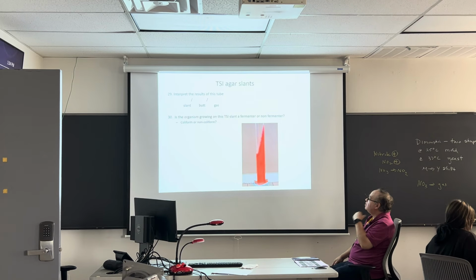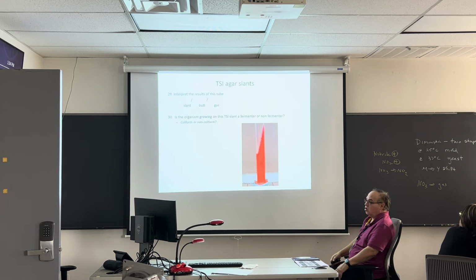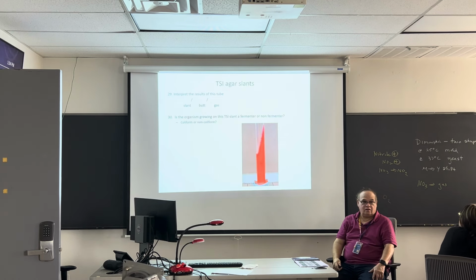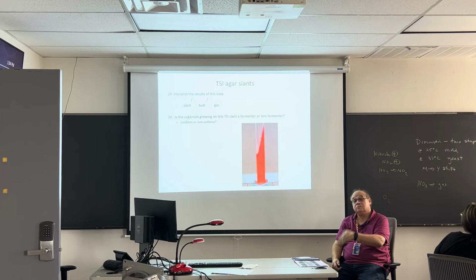Okay, let's go on. So here, I've got fuchsia here and orange here. Go. Fuchsia. So what is it? K, and no gas. Okay? Jeanette, you're making a face. Why are you making a face? What was my thinking? So you have to listen to me.